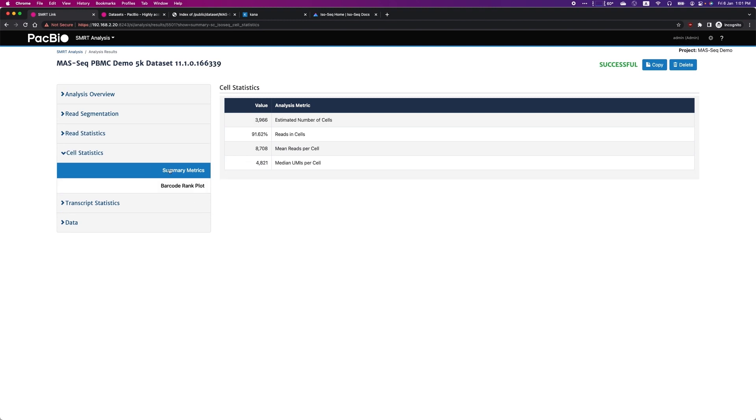Looking at cell statistics, you can see that 4,000 cells are estimated from this dataset, which matches closely with the expected input cells.